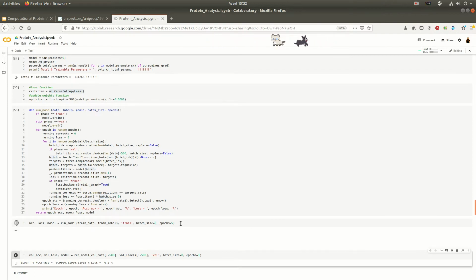So you can see the model is going to start training. And there it goes. The loss starts at 0.7. It's not very accurate. It's getting near chance. On the second time around, it's looked at all the proteins and it's updated itself. It got a little better. The loss got lower. The accuracy got higher. It keeps getting better. This is what you want to see. We're already up to 82% accuracy, right?